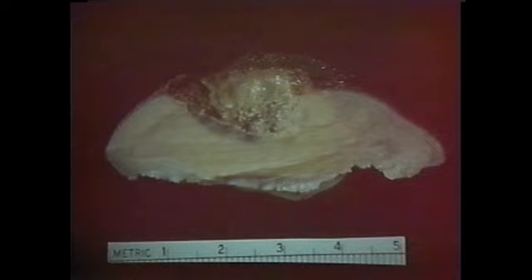We get this section. All of a sudden, we see these larvae inside the uterus of the female. Well, remember I told you spirurids had thick-shelled, small eggs with embryos. This is a spirurid, but this is different. This is Draschia. It's one of the exceptions. It has larvae within its uteri. It does not have the typical spirurid egg.